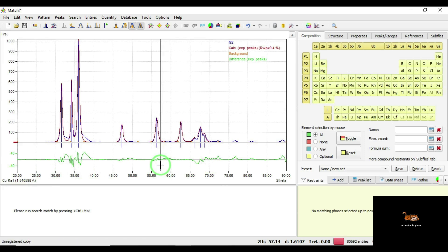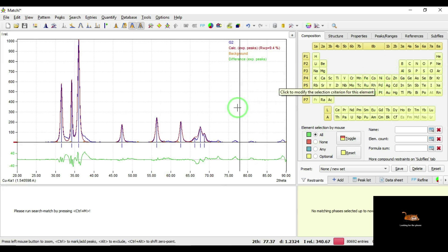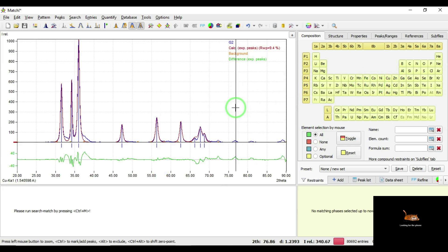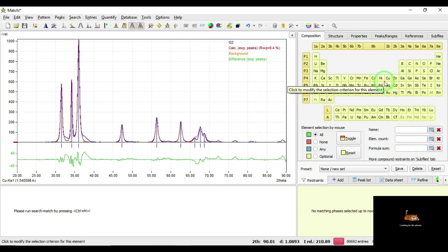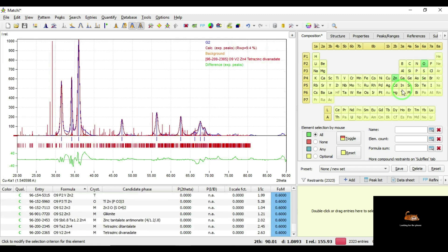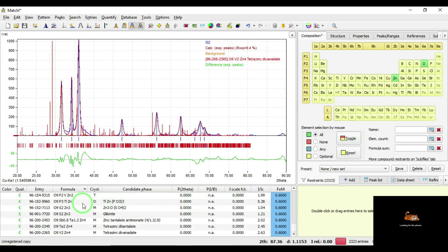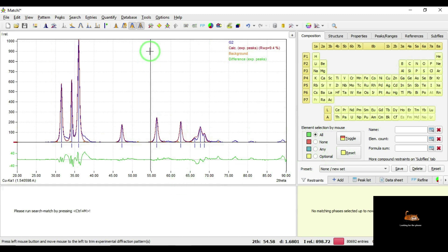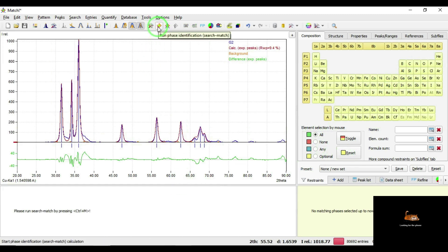If you have any idea about the sample, you can select the elements of this sample. Here I have prepared zinc oxide, so I know it contains Zn and oxygen — you can select Zn and oxygen. Otherwise, you can run the program automatically. Here I am going to select Run.